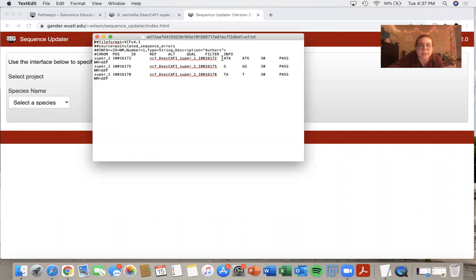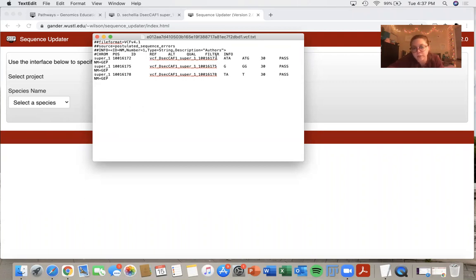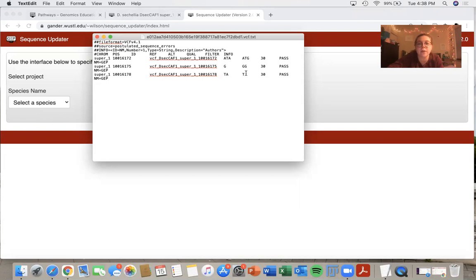The ID is this whole VCF, DSEC, CAF one line. The reference is the reference basis. So the ATA, the original sequence that we referred to, and the alternative is what I put in as a substitute.